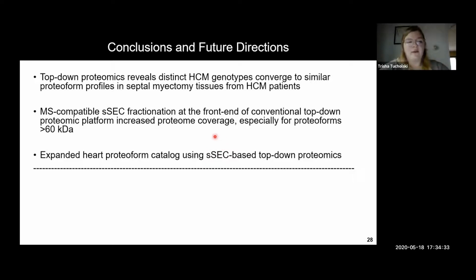And so we've used this technology to expand on our heart proteoform catalog. And this will allow us in the future to hopefully make quantitative comparisons in healthy and diseased samples.